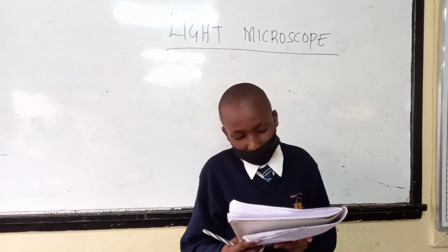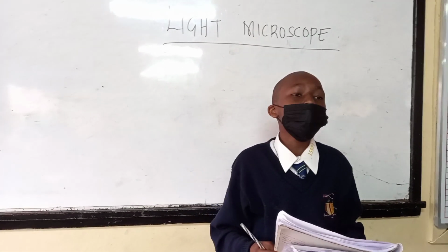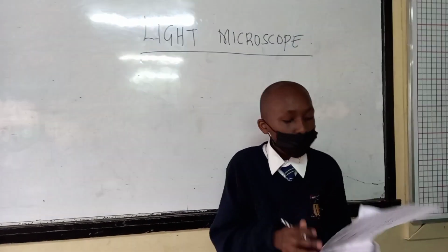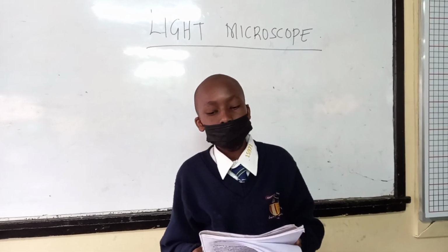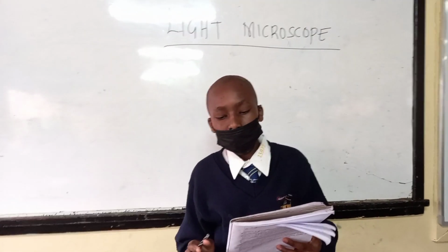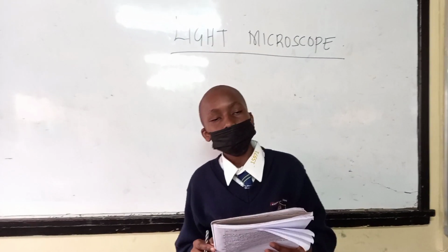Later, Anton van Leeuwenhoek invented a simple microscope with biconvex magnifying lenses used to observe the nucleus and unicellular organisms, e.g. bacteria. Both are light microscopes as they use light to illuminate the specimen under view. In the 20th century, 1938, Ernst Ruska, a German engineer, developed the electron microscope, which enabled much of the internal structures of the cell to be observed. Till date, it is widely used in biology to show more details of the cell.